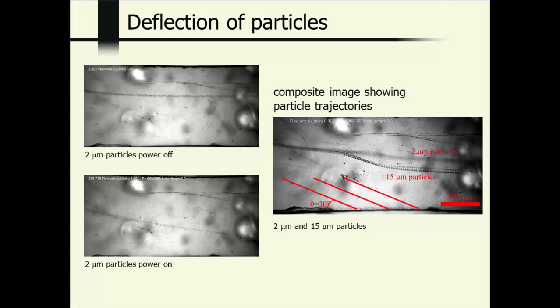Here we have a mixture of 2 micrometer particles and 15 micrometer particles. This is not a snapshot. This is now a composite image. So it shows the pathway of many particles. And you can see that the 15 micrometer particles are deflected into a node line and the 2 micrometer particles are not.